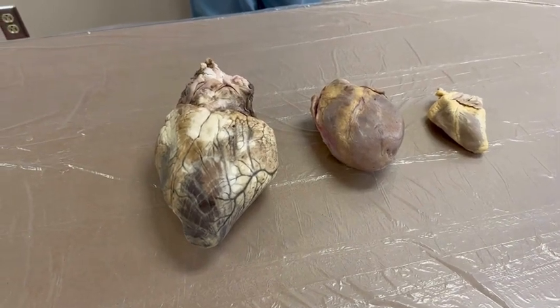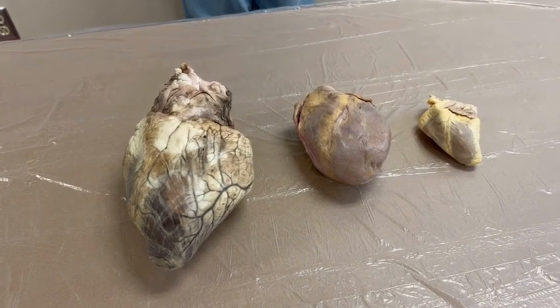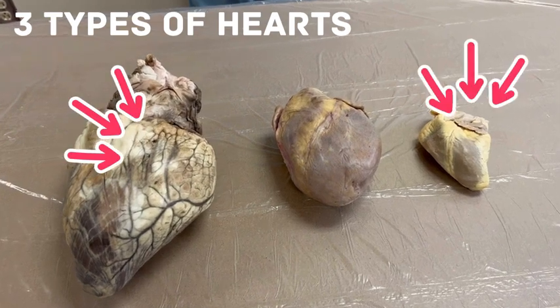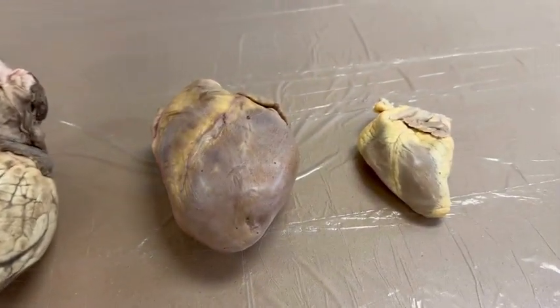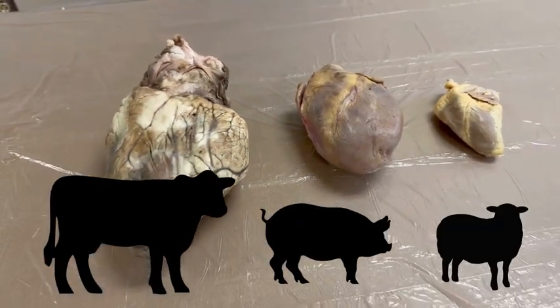Hi everyone! Today we're going to explore how animals, including humans, are alive and active. We'll be comparing three types of hearts: a cow heart, a sheep heart, and a pig heart. Each one is similar in structure, but each also has unique features that match the size and needs of the animal it belongs to.